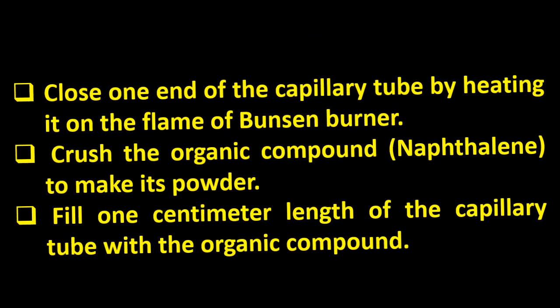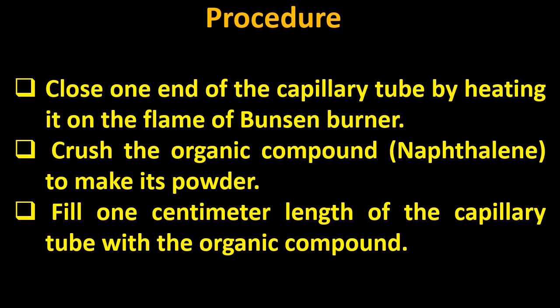Let us start the procedure. First of all, close one end of the capillary tube by heating it on the flame of a Bunsen burner. The capillary tube is a small glass tube just like a straw, but it is made up of glass. Secondly, crush the organic compound naphthalene to make its powder. Then fill one centimeter length of the capillary tube with the organic compound.